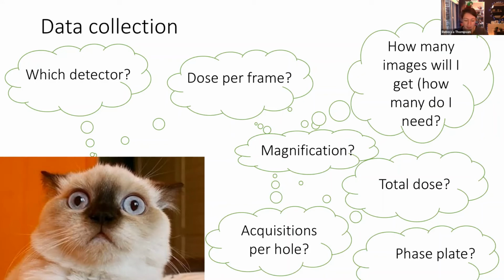So what we'll typically do is meet with you before your data collection session and run you through all of these kinds of questions and just talk you through all of the different options, using the experience that we've had with a range of different projects to design a single particle data collection experiment that suits you.